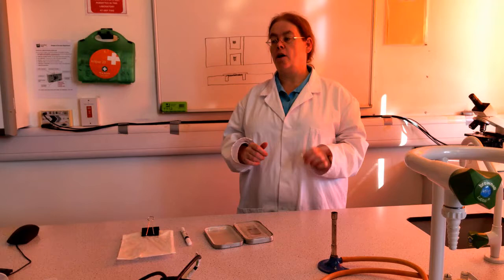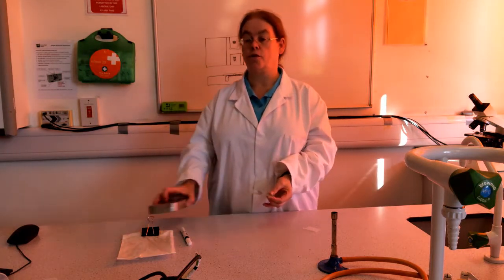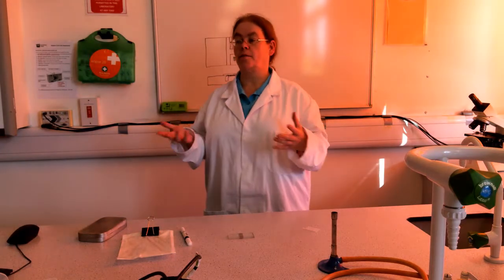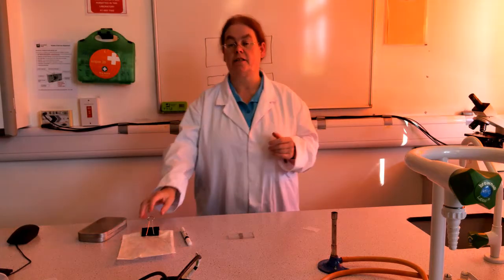Anyway, so what do I need to show you? I just need to show you how to load a haemocytometer. As you can see, I'm not wearing goggles. I haven't lit my Bunsen because I'm not using actual microorganisms. I'm just going to use water.